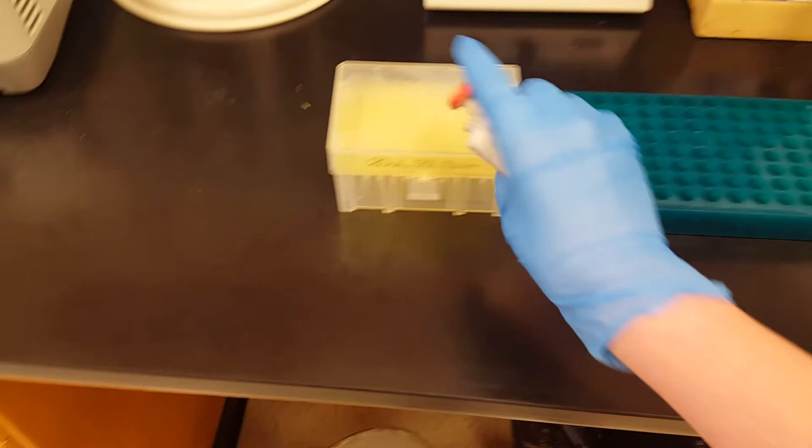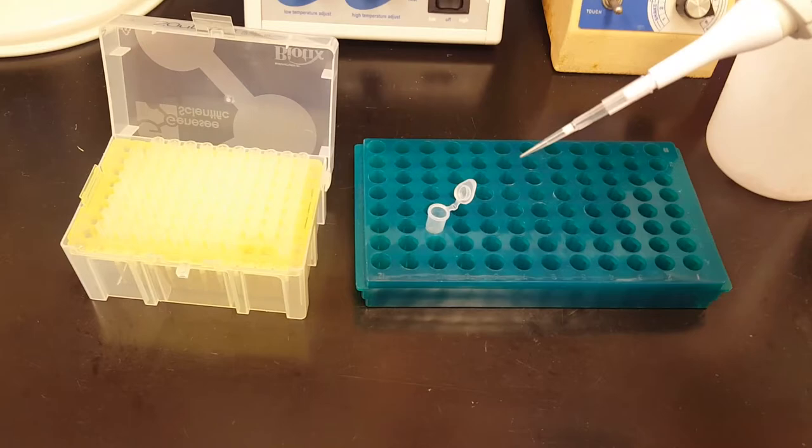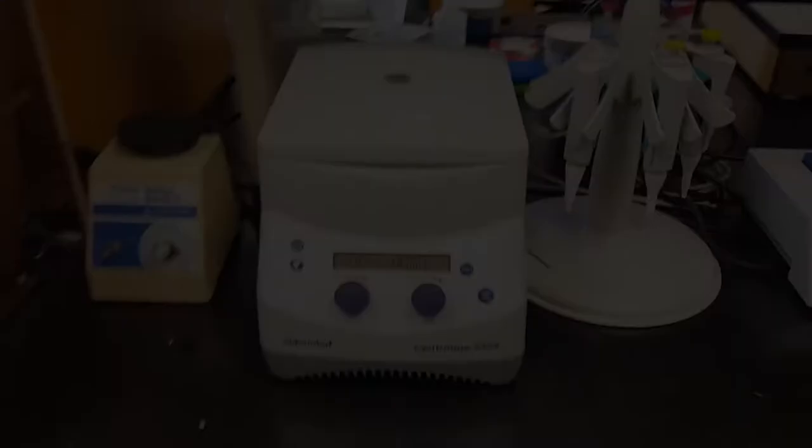To transfer liquid between different micro centrifuge tubes we use a pipette. A pipette can be set to transfer a specific amount by turning the dial at the top, and then we use disposable pipette tips which allow us to prevent contamination between samples. When you push down on the plunger and then slowly release it, it creates suction which draws liquid up into the pipette tip. Then we can transfer it to a different tube and eject the tip so that we can get a new clean tip to use for the next sample.